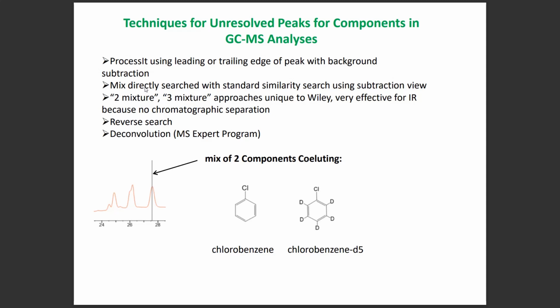The third is the 2-mixture, 3-mixture approaches unique to Wiley, which are very effective for IR because no chromatographic separation is employed, but are very useful even for GCMS analyses. A more standard reverse search will be demonstrated. And finally, deconvolution using the MS Expert program will be briefly discussed, and discussed in more detail in a later video.